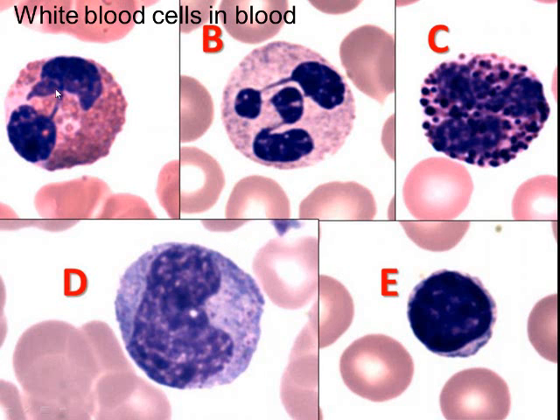So if we look at some of these in real cells, we can see an eosinophil here, a lobulated nucleus with different lobes. It's the same nucleus, it's just different lobes. And we can see the granules. And here we see a neutrophil with various lobes, small granules, and a basophil. The nucleus is below, but you see some granules on top. It's hard to see the nucleus.